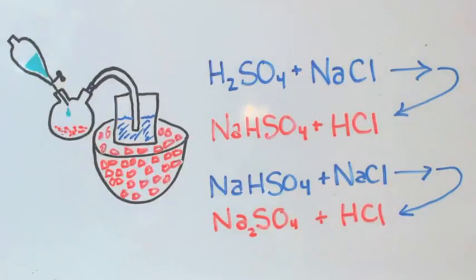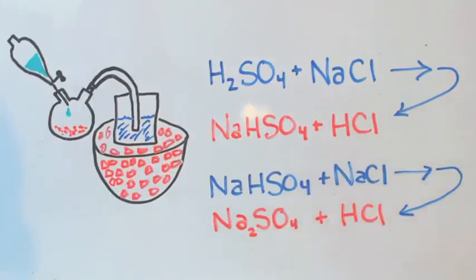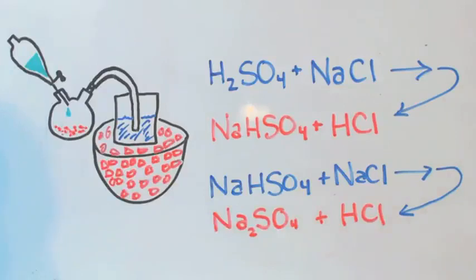All you do is take your sulfuric acid and this is your table salt. It has to be a chloride like sodium chloride or potassium chloride. Sodium chloride is obviously the cheapest. You just drip the acid on there and it will produce hydrogen chloride gas, and that can be let into some water. You're going to have to put this in ice, actually more than ice, put it in a salt water bath. Try to get it down as cold as you can because it's real hard to get it to really 35%, but you can get it really concentrated if you ice it down. Make sure you keep it really cold so that all the HCl doesn't just escape.